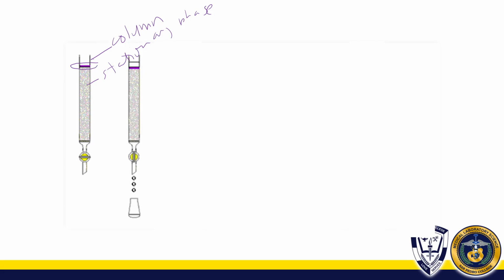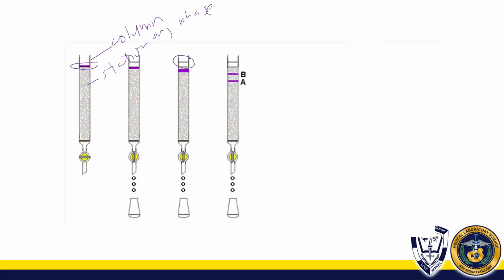And then so ingani ang mahitabo. Once you place your analyte, and then amoy makita actually kanina, kaning white na part here, this is actually your eluent. In order for your sample to move and then start being separated, you need to add an eluent. And then, after some time, hinay-hinay from your original analyte, your components will now separate.